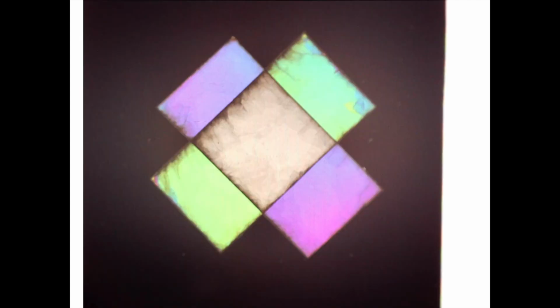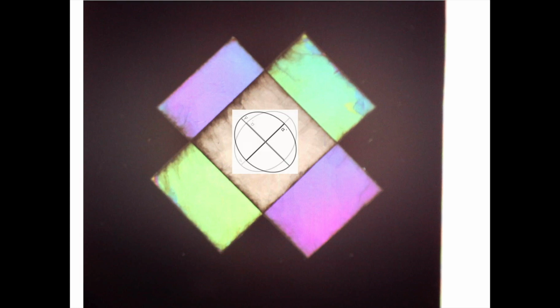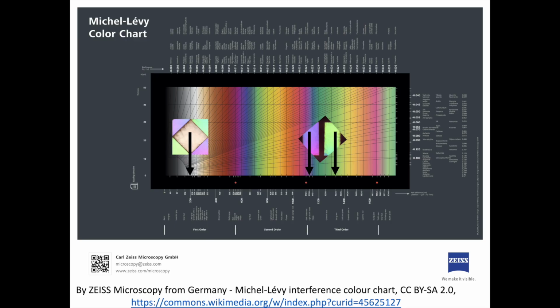When we overlap these plates so that they're perpendicular to one another, our refractive indices are at odds with one another. Gamma of one plate is aligned with alpha prime of the other, and vice versa. Because of this, the interference color that we see where these plates overlap is the difference between the interference colors of our two oriented Muscovite plates.